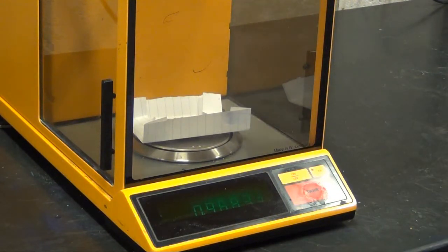As it's within 0.05 of a gram, this amount will be recorded and that will be the amount of sample used in the further experiment.